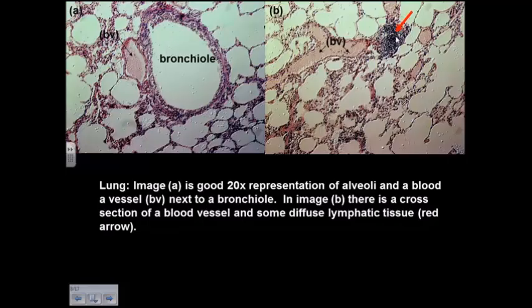Okay, if you see this in the lungs, it's responding to some kind of inflammation. So this person has some pathology too. And you can tell there's pathology going on because some of the alveolar walls are thickened. So this person has some sort of pneumonia. This one over here on this side looks a little better. Okay.